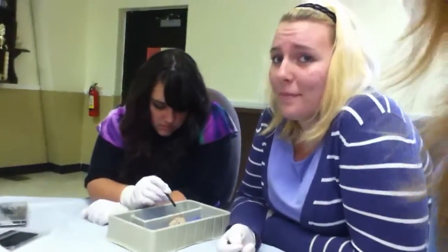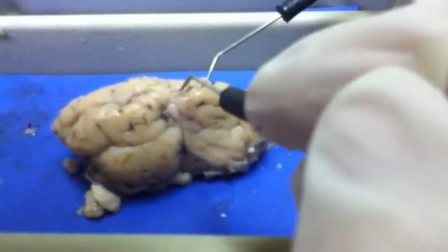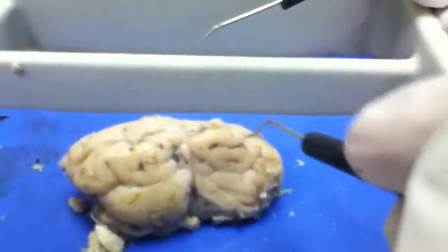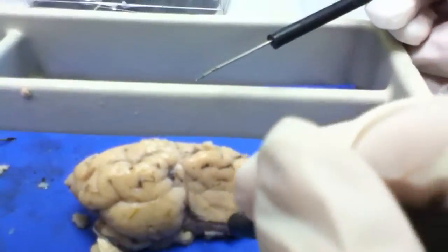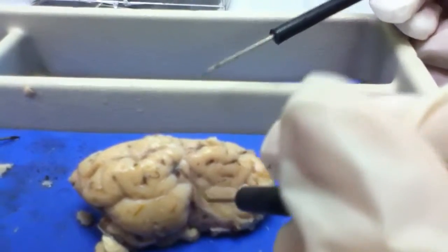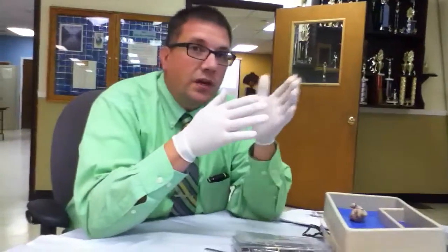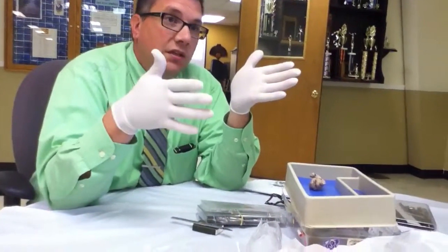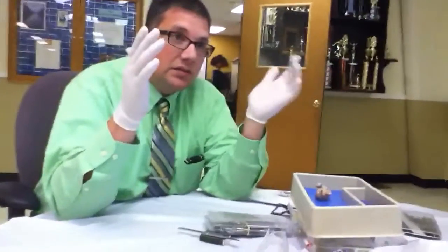The middle section that goes down between the two hemispheres has a name. Remember back in your days of biology in high school? Right brain, left brain? So we know that the right side of the brain works the left side of the body — scientific proof of that.